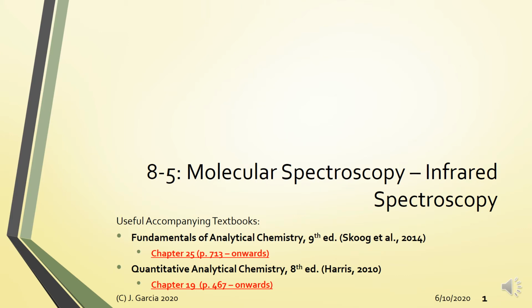Hi, and this is module 5 for part 8. So for this module, we will be discussing infrared spectroscopy. Again, please take note of the respective chapters or pages in the textbooks for this topic.